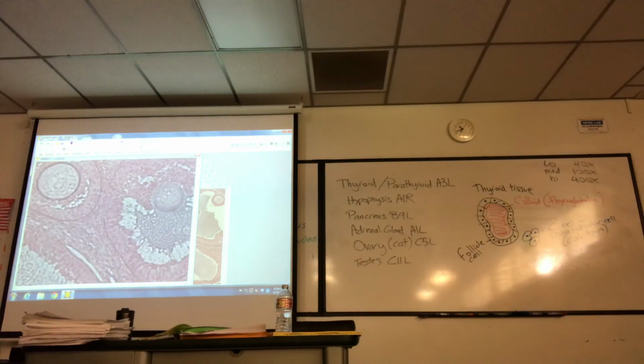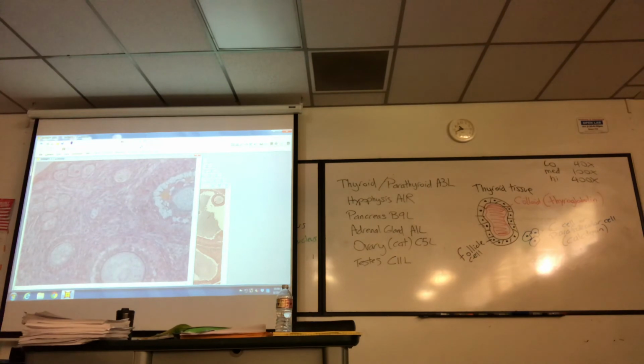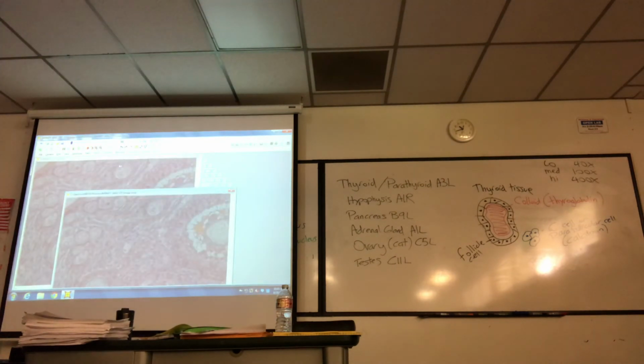Let's go to 400. This is 400x. Blue for white balance. Okay, I think we can use this.